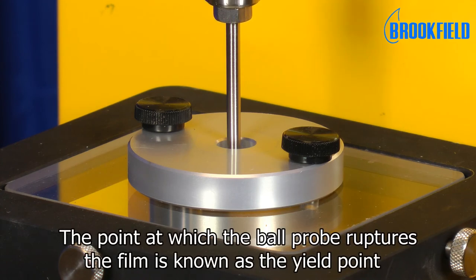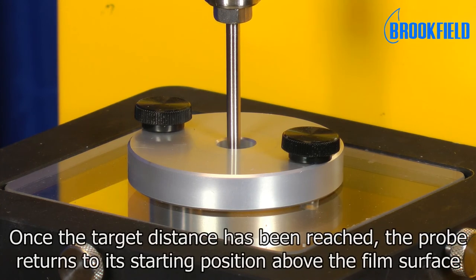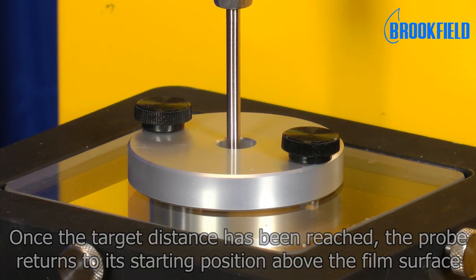The point at which the ball probe ruptures the film is known as the yield point. Once the target distance has been reached, the probe returns to its starting position above the film surface.